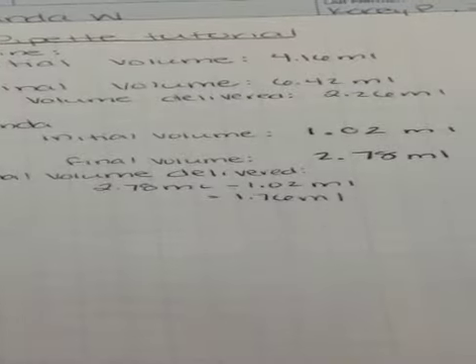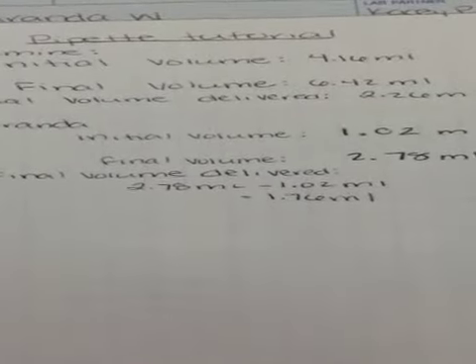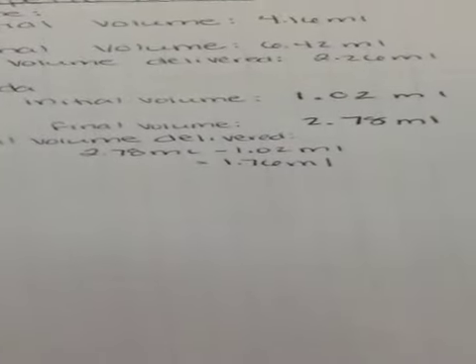Now you find the final volume delivered. The final volume delivered is the initial volume subtracted from the final volume, leaving the final volume delivered to be 1.76 milliliters.